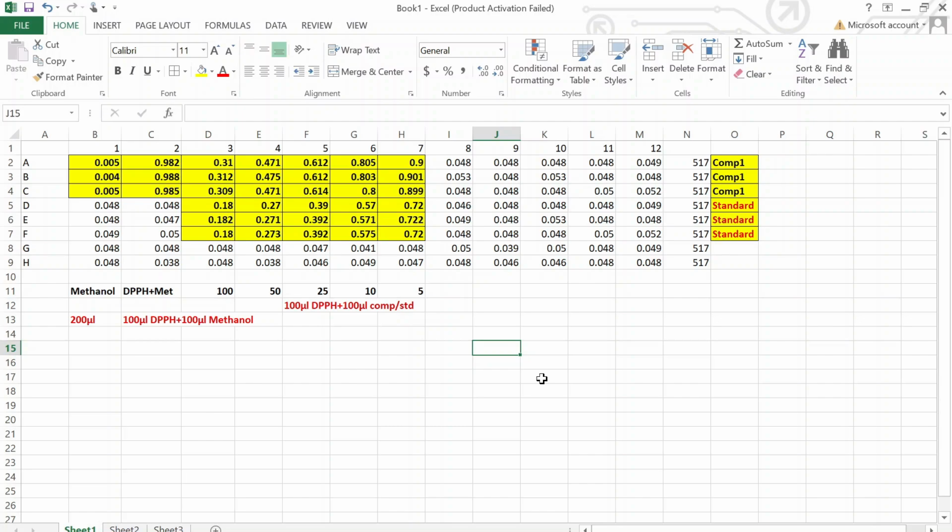In this video, I will be telling you how to perform the analysis after the DPPH assay, and I will also be discussing how to calculate the percentage DPPH radical scavenging activity. So this is the data that I have got after performing the experiment.